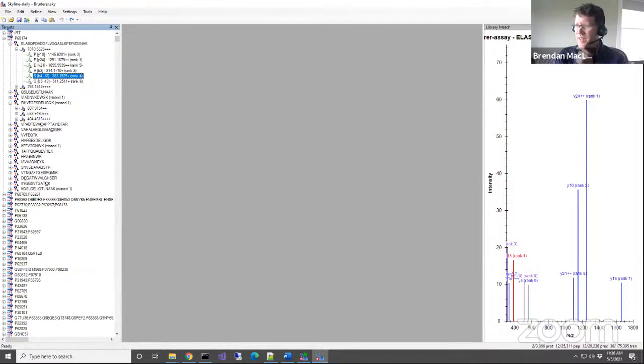Okay, so a general question on choosing the number of transitions to use. Should this be dependent on the length of a given peptide? Is it possible to adjust the required transitions for a peptide call based on peptide length? It is not, and that's not the way it's done typically. So I'm following the general way that people do things, the standards.